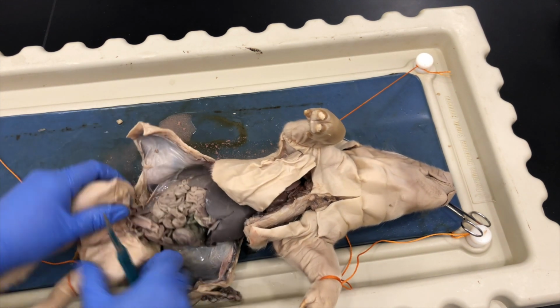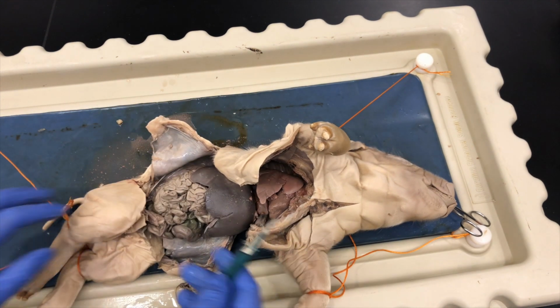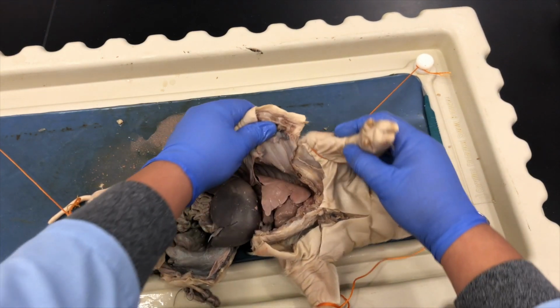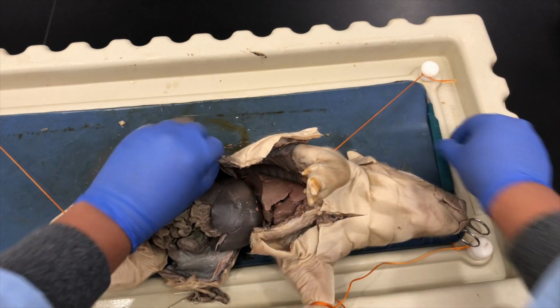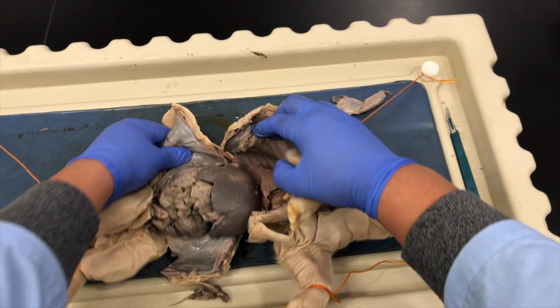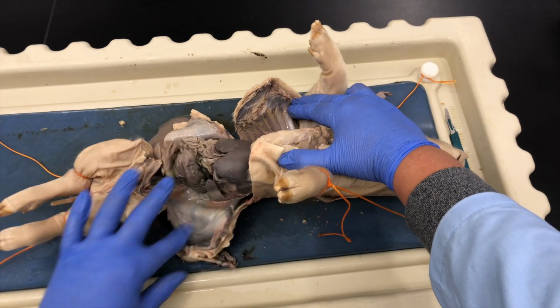Here I'm making the final cuts to the already made flaps that I've cut through. Trying to hold it down and just trying to do it by hand at this point as much as I can. You have to kind of like open it up, if that makes sense. Open up the cavity.